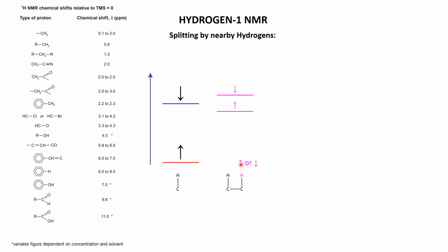So because of the effect of this adjacent hydrogen here, well now we could see photons that take this proton up to here, this much energy, or we could see photons that take this proton to this energy. Okay, in other words, there will be two absorbances associated with this photon because its original jump has been split by the one adjacent proton.